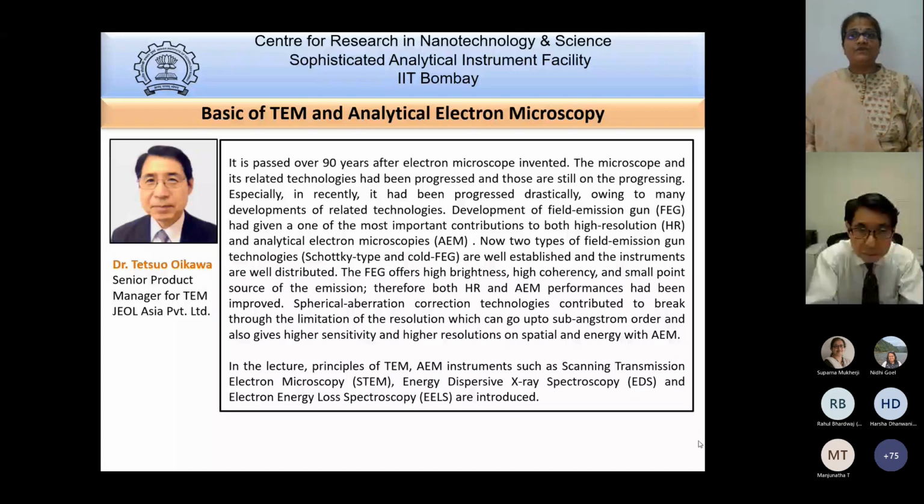He was also invited professor at the University of Paris for 8 years during 2005 to 2013. Dr. Oikawa received his doctorate degree from Kogakuin University in the field of electron wave optics. He has given multiple talks and seminars all around the world and has 3 papers published in the Nature journal. We are sure that this talk will be useful to you to understand transmission electron microscopy as well as associated analytical techniques like EDS, STEM, and EELS for your research purpose.